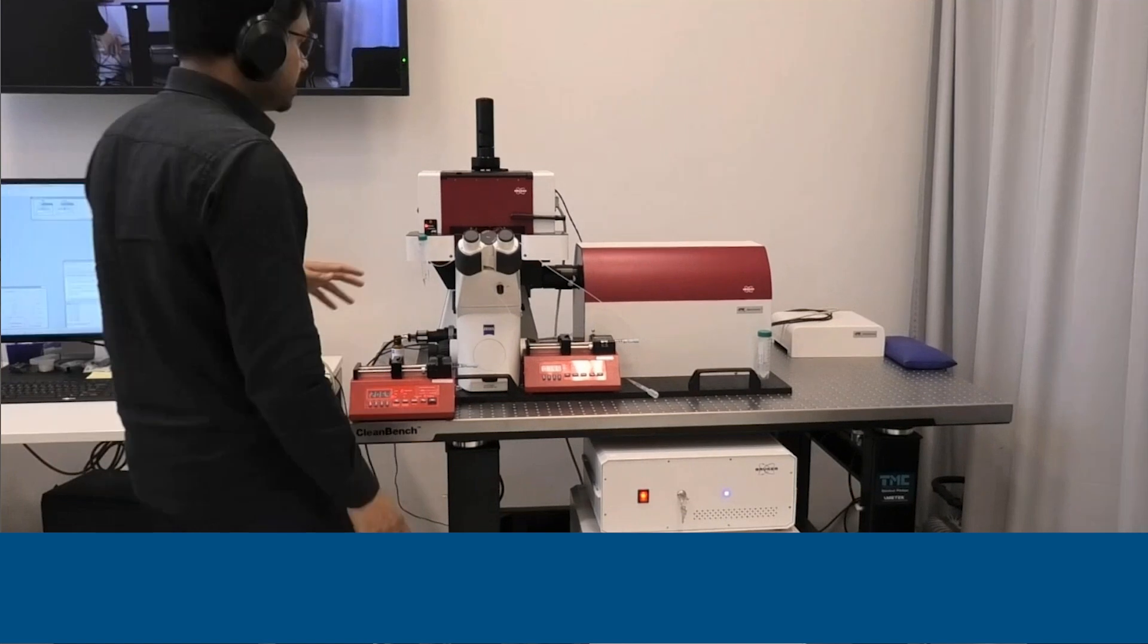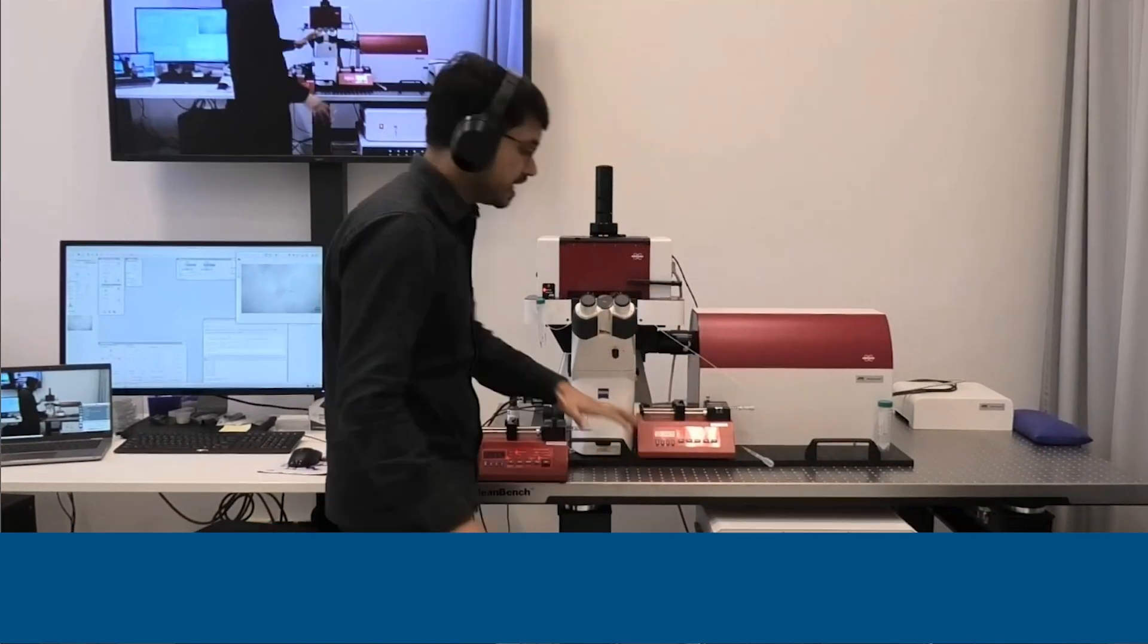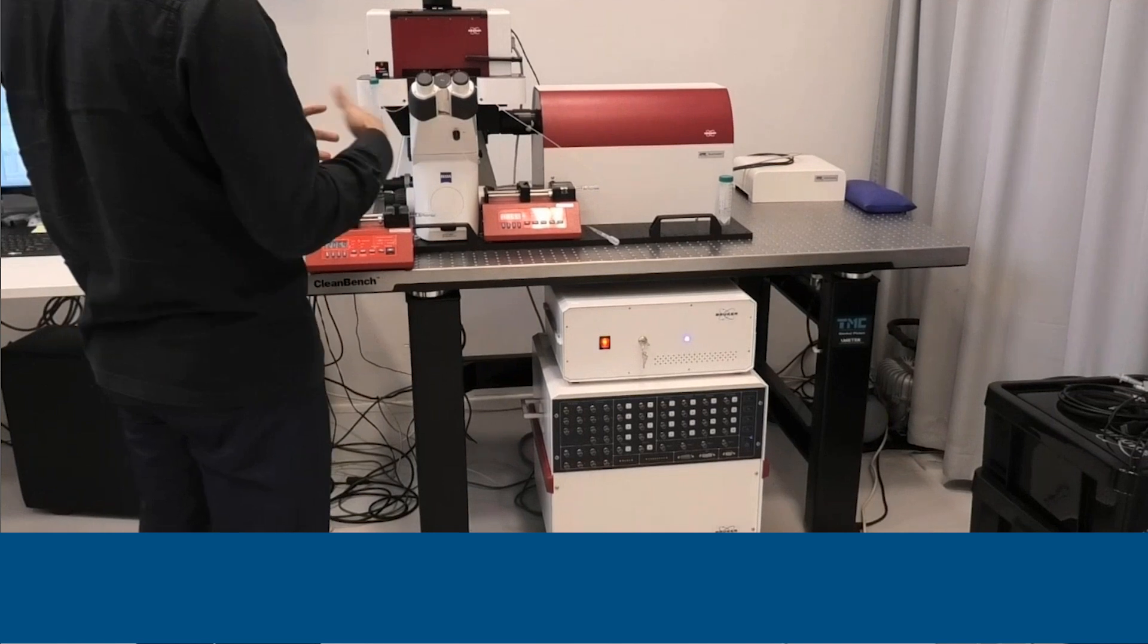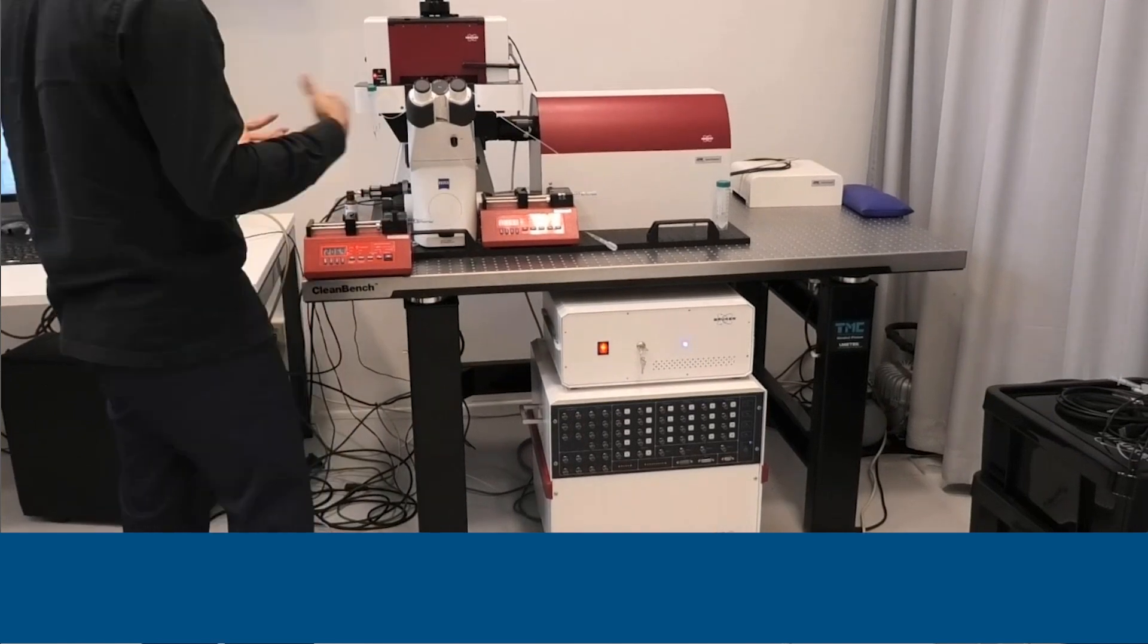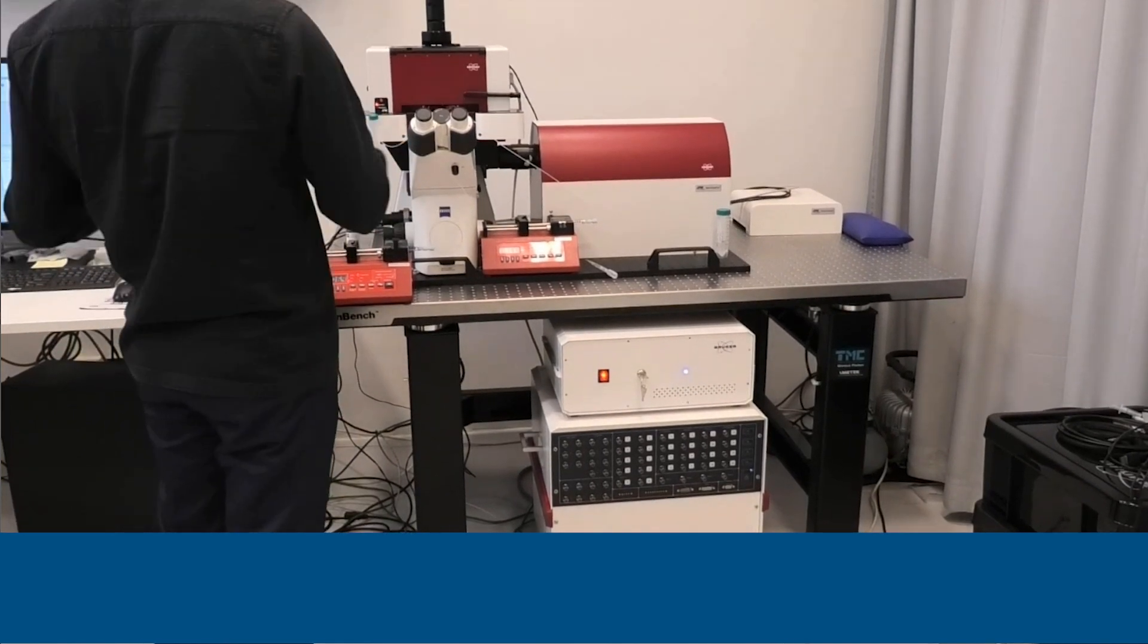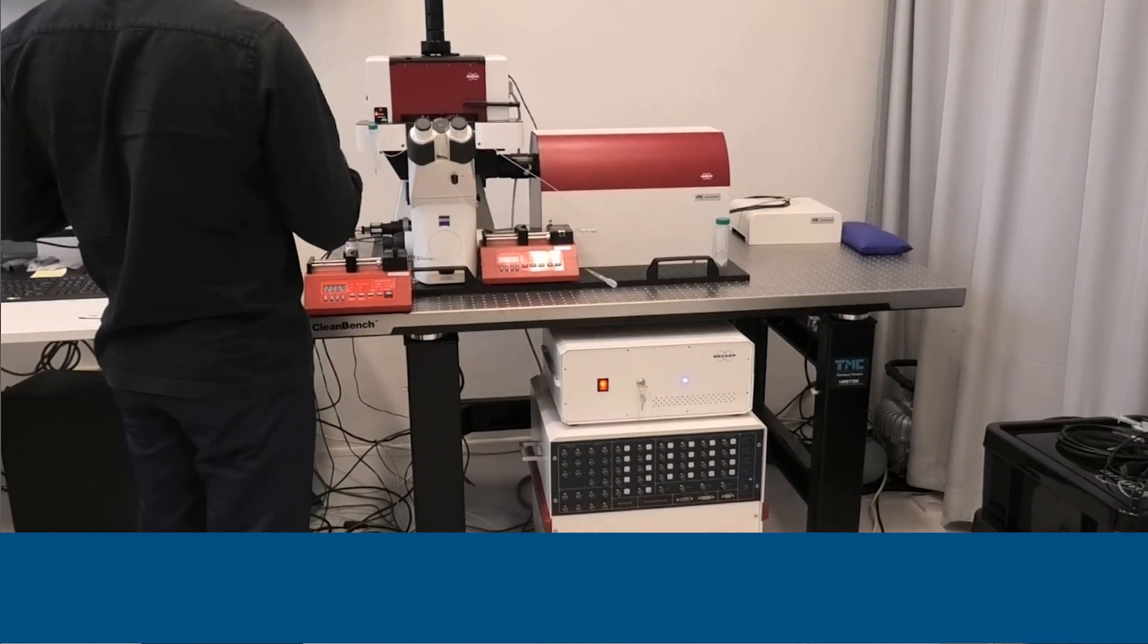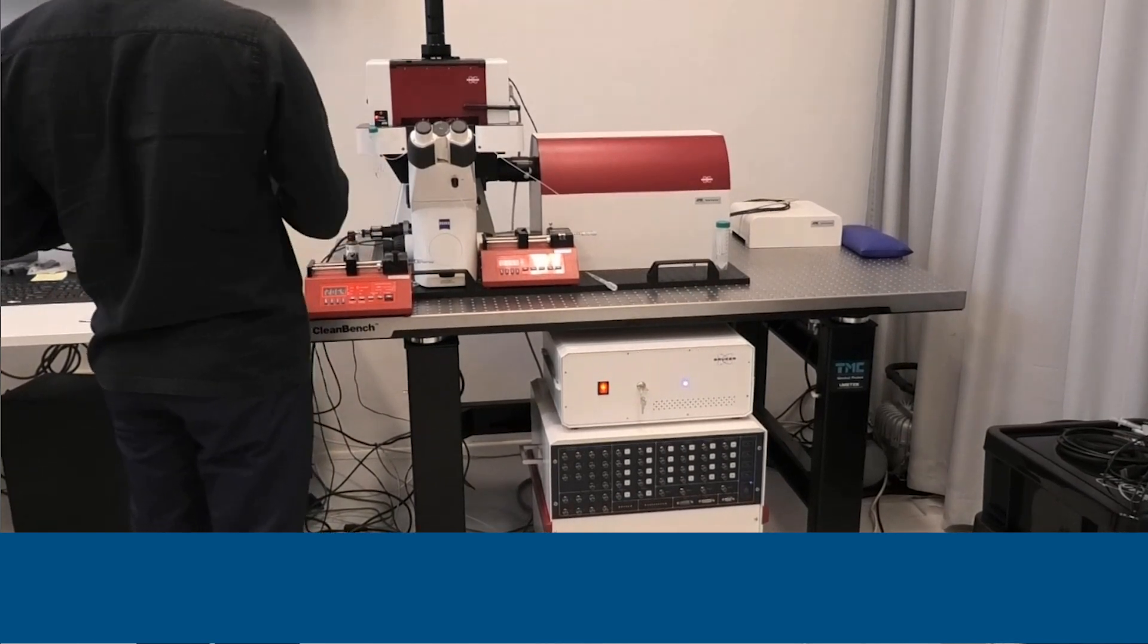I would like to start from the bottom. So we have a controller which is used to control all the electronics that we have in the system, as well as it is communicating continuously with the computer to record or store your data.